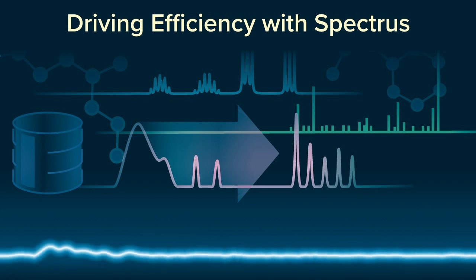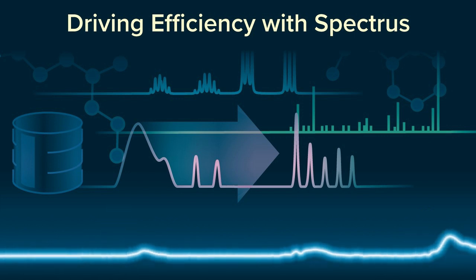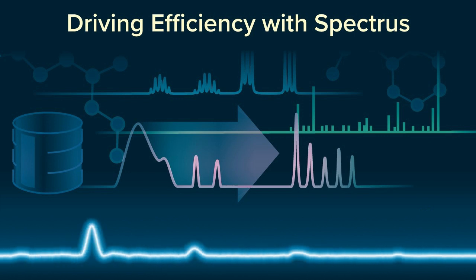NMR Workbook Suite will predict the spectra based on the molecular structure, and then we will correct that prediction manually and optimize it. Once we have a perfect match between the prediction and the reality, then we do a quality control, a quality assurance release of the data. So it gets verified by an additional 2 people. And once it's released, we are calling this a digital reference material.